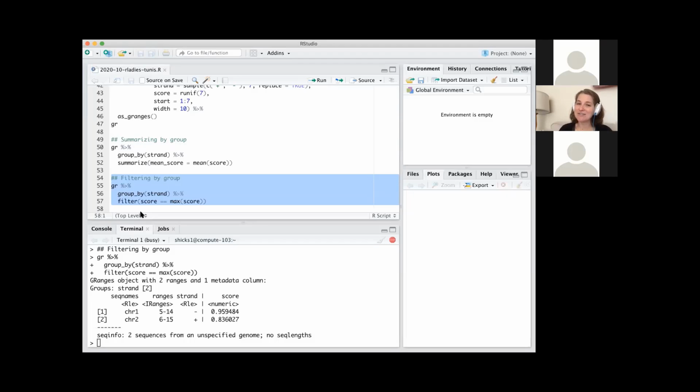It has a lot of functions that you may recognize from dplyr, but then there are a lot of new ones that you don't recognize that are very specific to genomics, such as the anchoring that we talked about. You have to figure out, do I want to modify genomic ranges widths based on the start, the end, or the middle, and so forth, things like that.